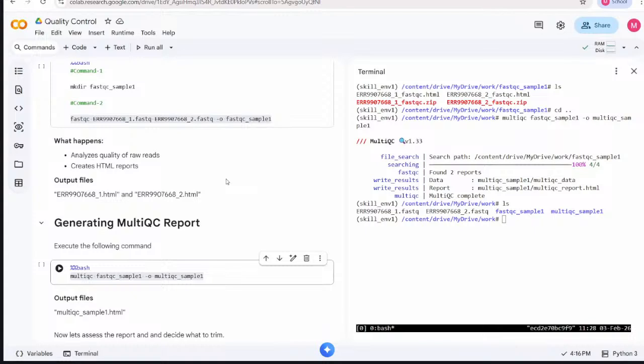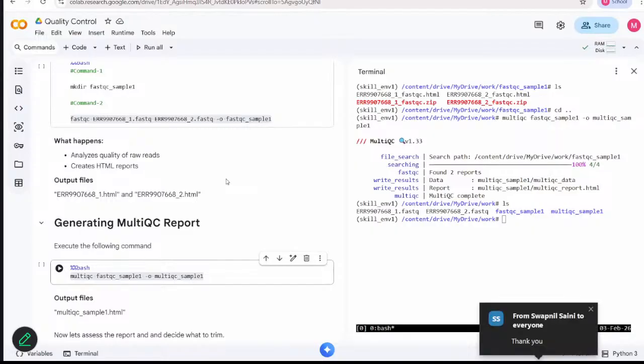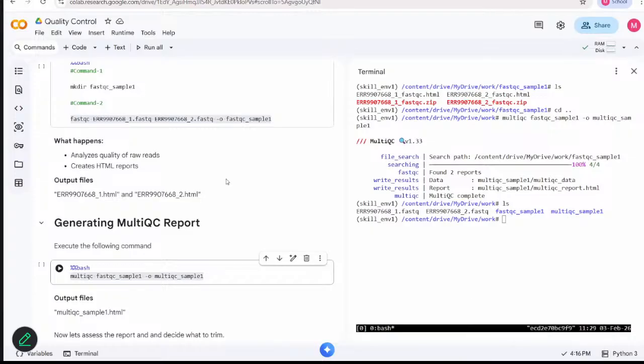Okay, you just need to go into your directory again. Go into your work directory. You just need to go into your work directory again. You have come out of it. Okay, okay. Yeah, work and workshop. Just do cd workshop and you will be inside that.